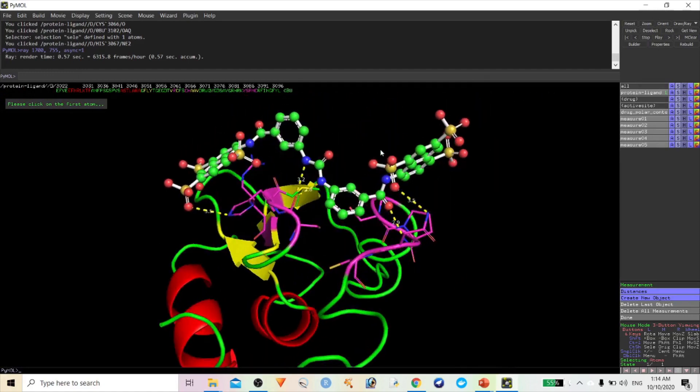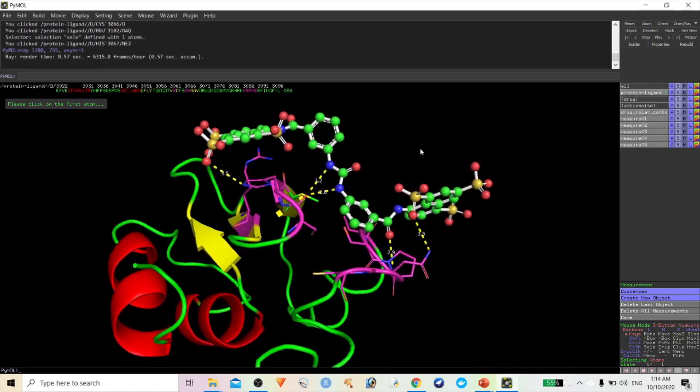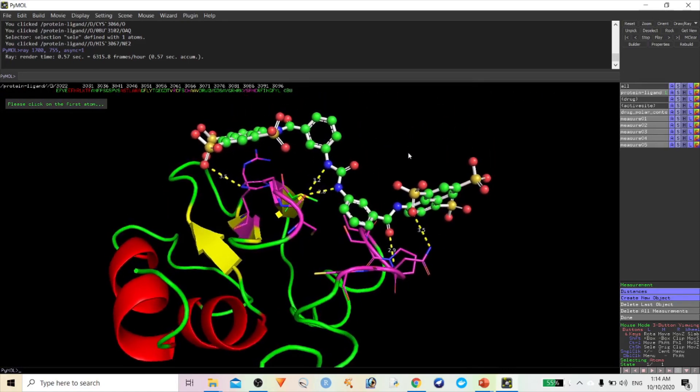Like this, we can easily find out what interactions are between the ligand and protein molecules, what types of interactions are there, and also which amino acids are surrounding the ligand molecule.